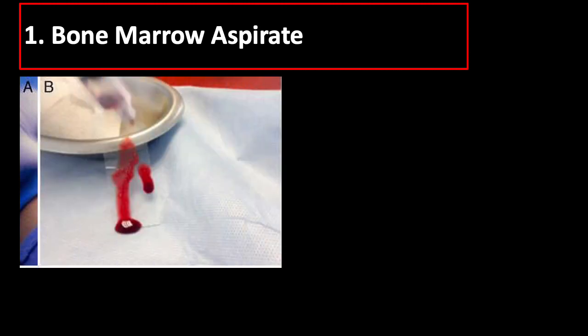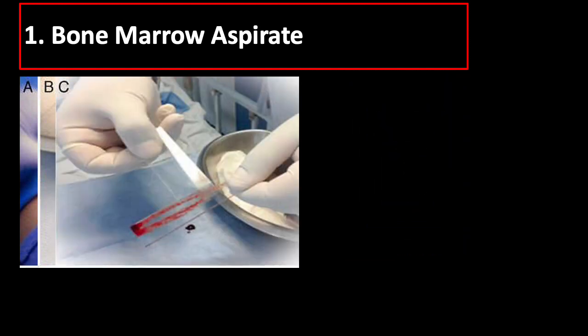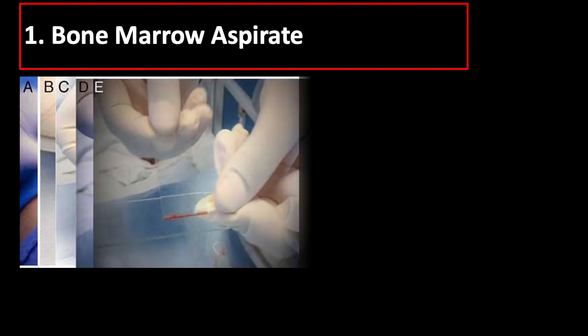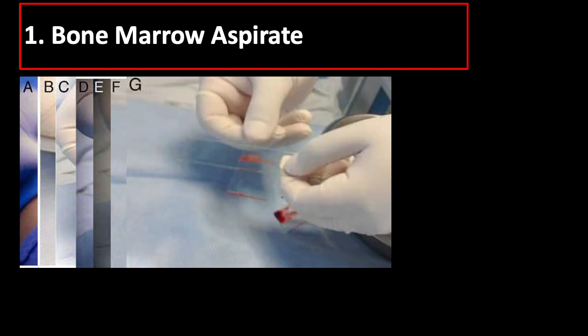Place a few drops of aspirate on a slide held vertically to facilitate visualization of the bone marrow spicules, seen as granular particles on the slide. Then, using the edge of a second slide, separate and isolate a few bone marrow spicules from the rest of the sample and transfer these to a third slide. Without applying pressure, distribute the spicules in the center of the slide. Place the second slide across the third slide to form a cross with the spicules in the center, then gently but quickly slide the second slide over the third slide to extend the spicules along its length.